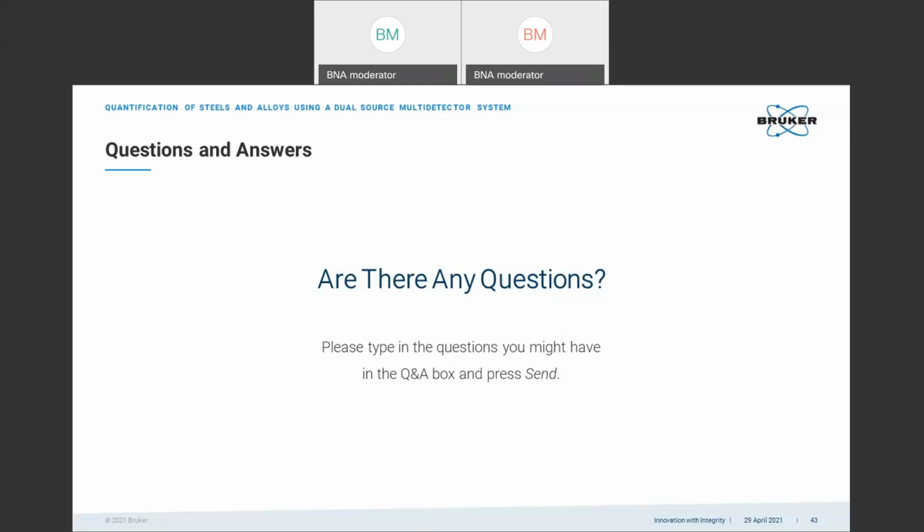So another question here related to standards. I guess this is a two-part question. What standards did you use? And the follow-up question is, that was for WDS, but when combined with EDS and XRF, do you need to use standards for all techniques and all elements?